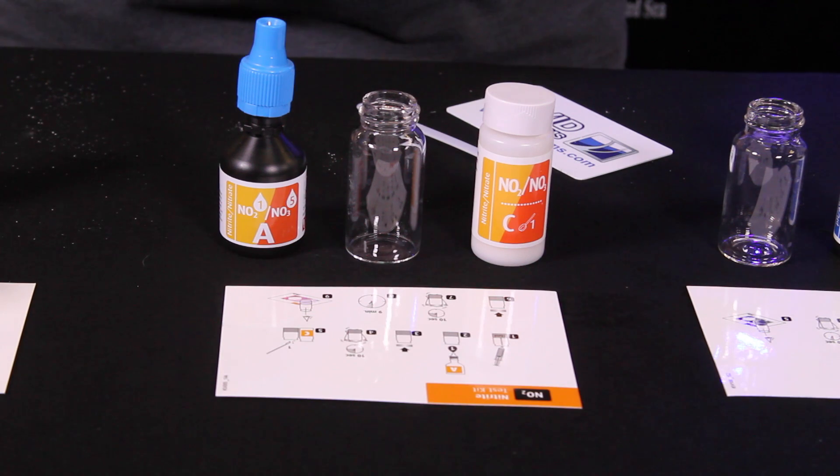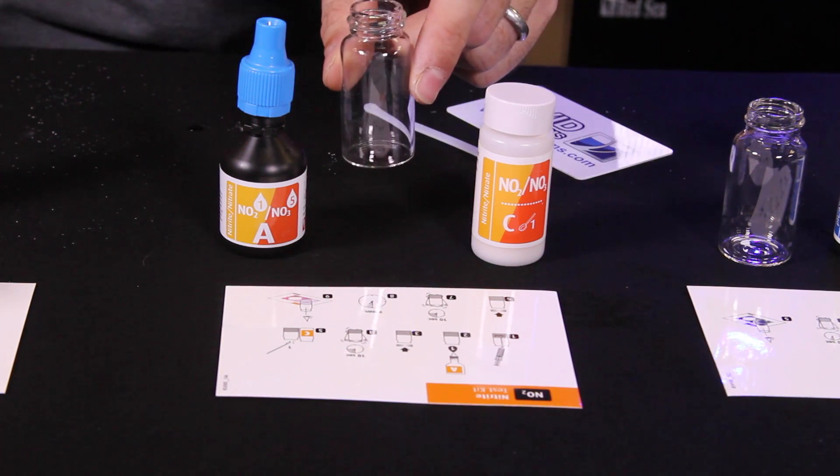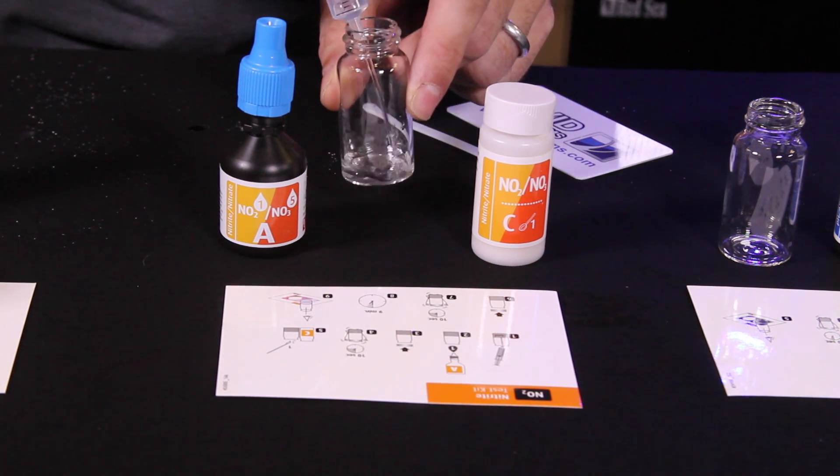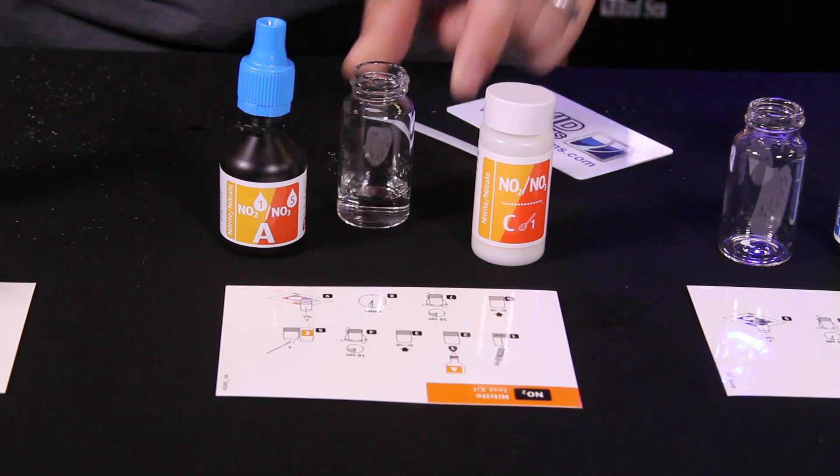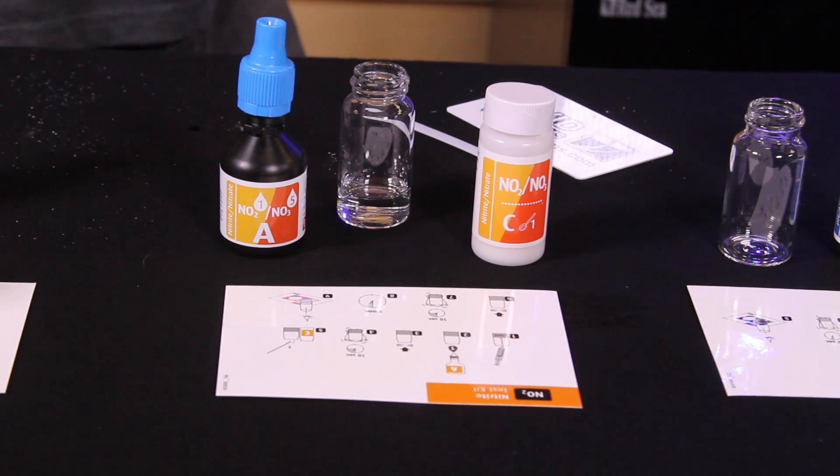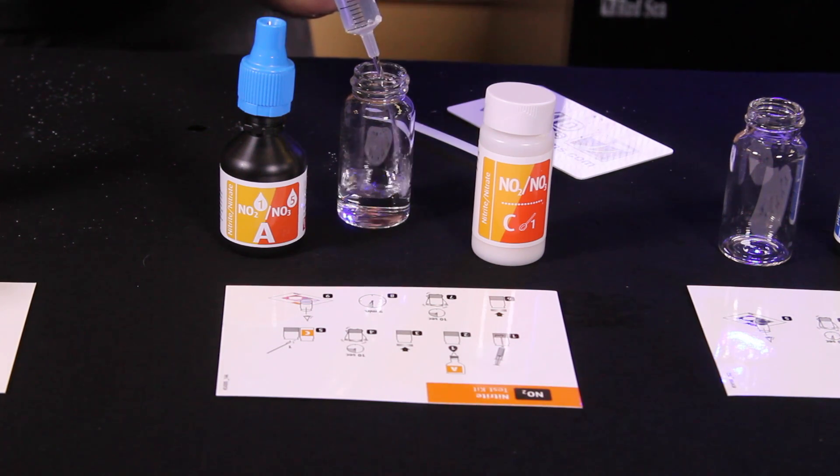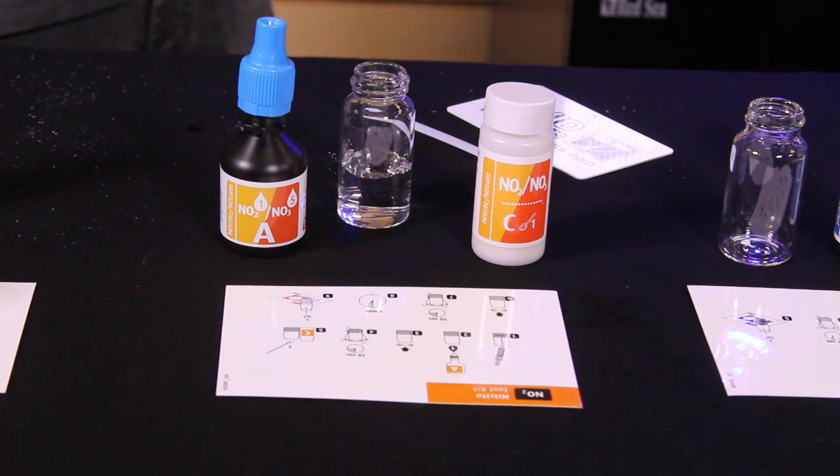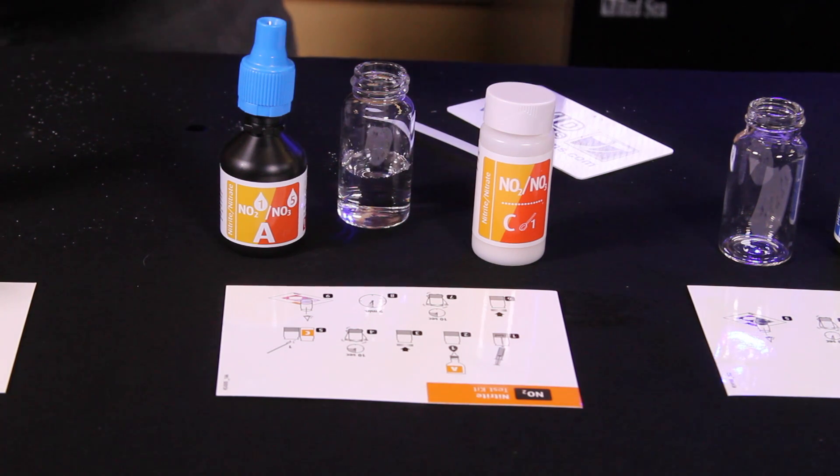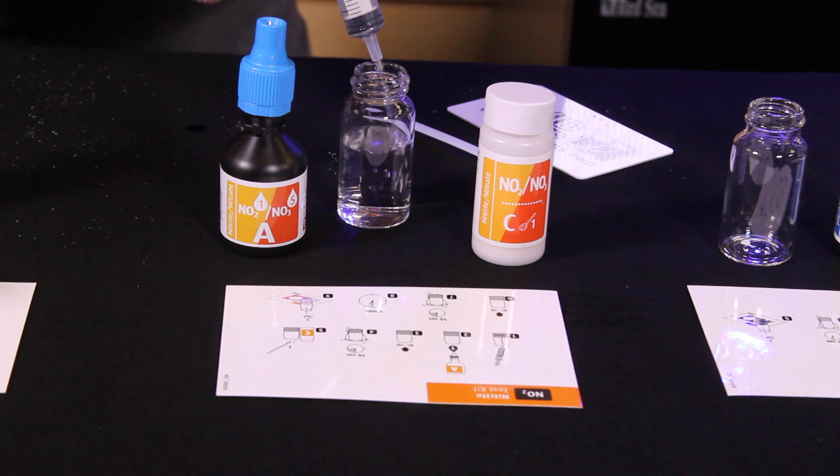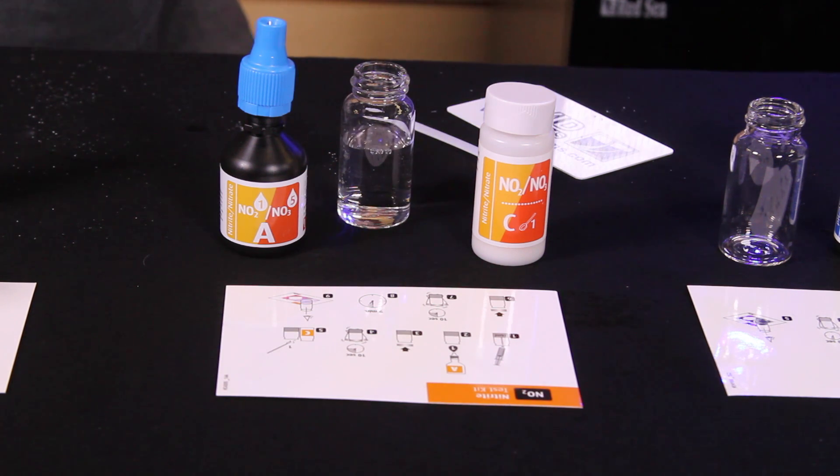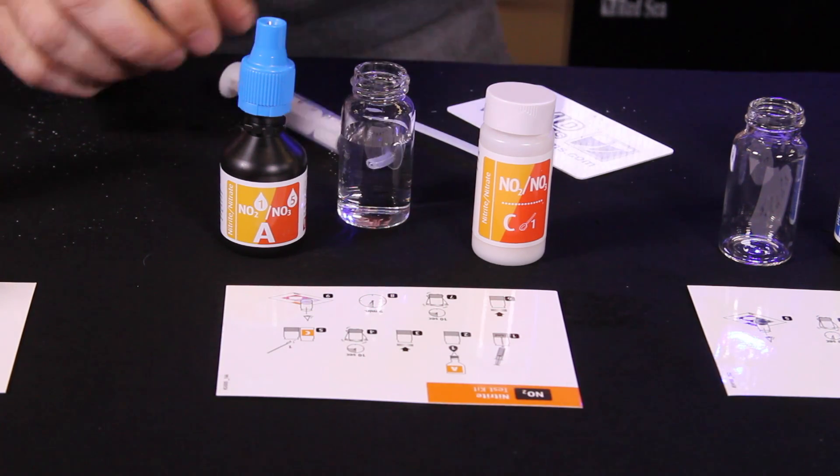All right, now let's go ahead with our nitrite tests. With this test, we need to add a total of 16 mils to the test vial. So there's five. Another five. And there makes 15. And one final milliliter. Make 16 milliliters of sample water.